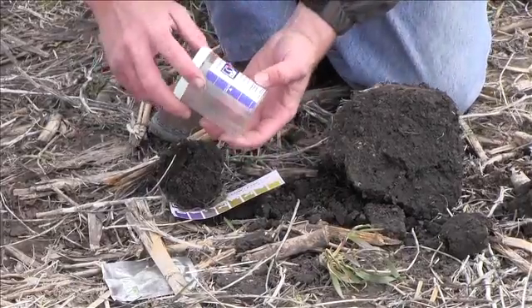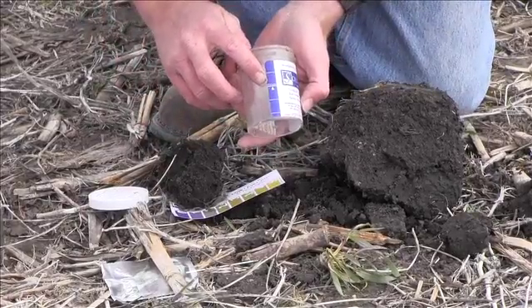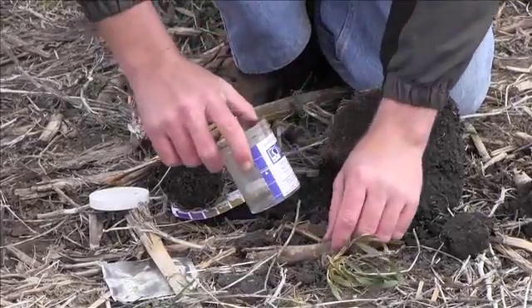Here we have the Solvita Respiration Field Test. There are two bottles and on each bottle there is a line for a fill line.